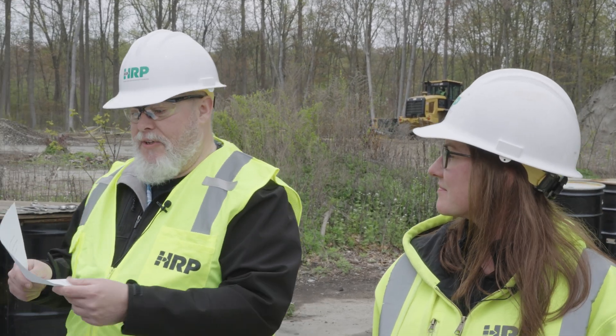Our goal is to collect a sample to confirm that this is clean to be able to recycle the drums. What we're doing here today is the PCB wipe sample — I'll be reading these instructions and Lauren will be taking the sample.